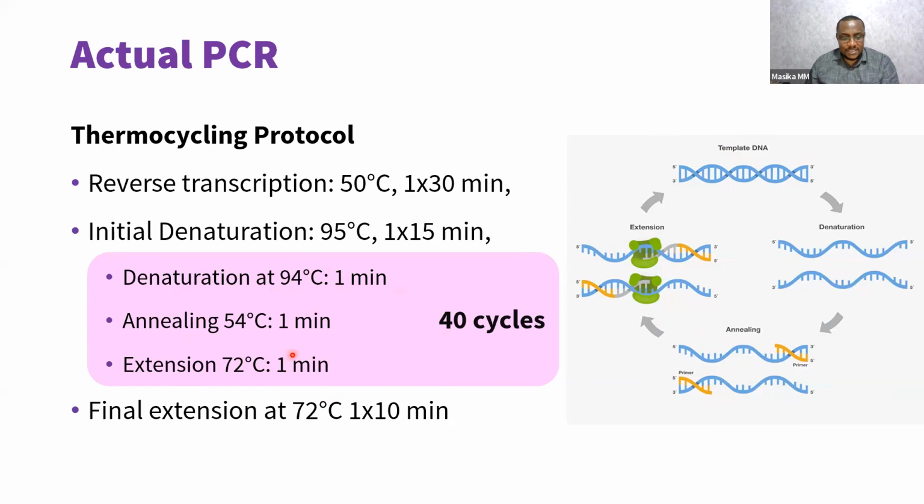But this is not done manually. You set a machine that keeps doing this in an automated fashion. Once you set the machine and you put the samples, you just come back after the PCR has ended, or if it's a real-time PCR, you can look at the screen to see what is happening. I hope that is clear now.